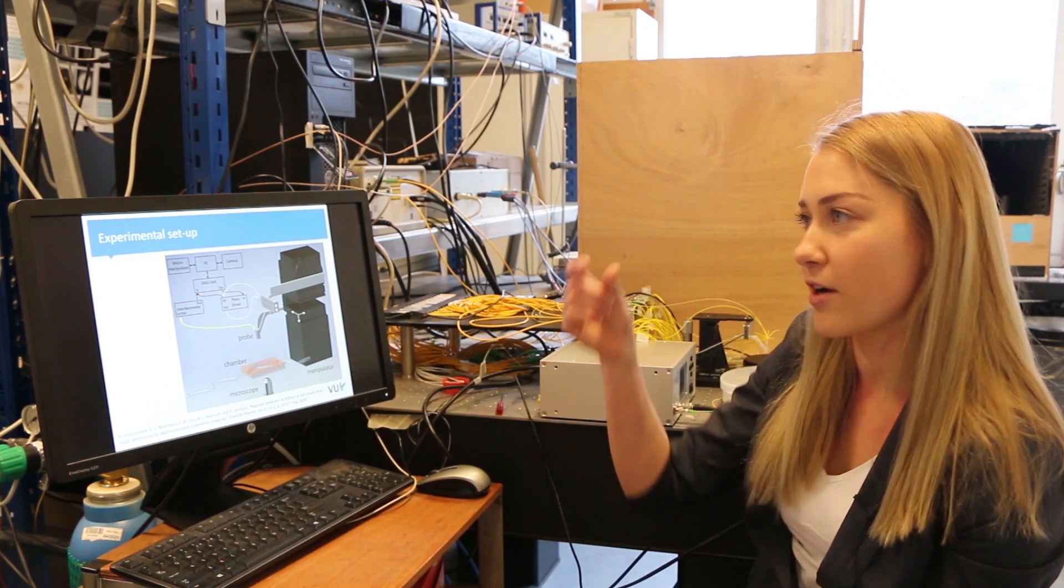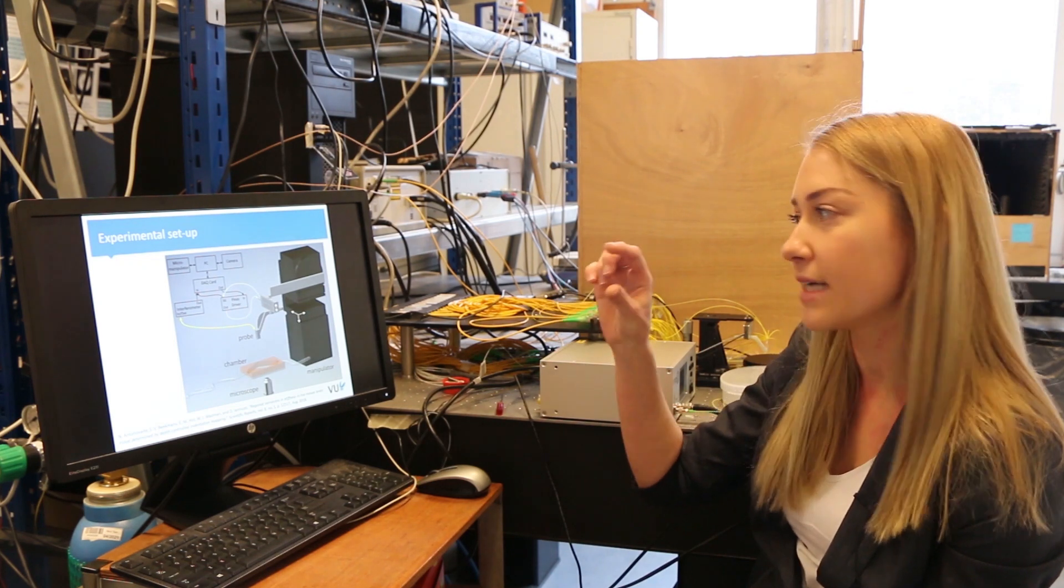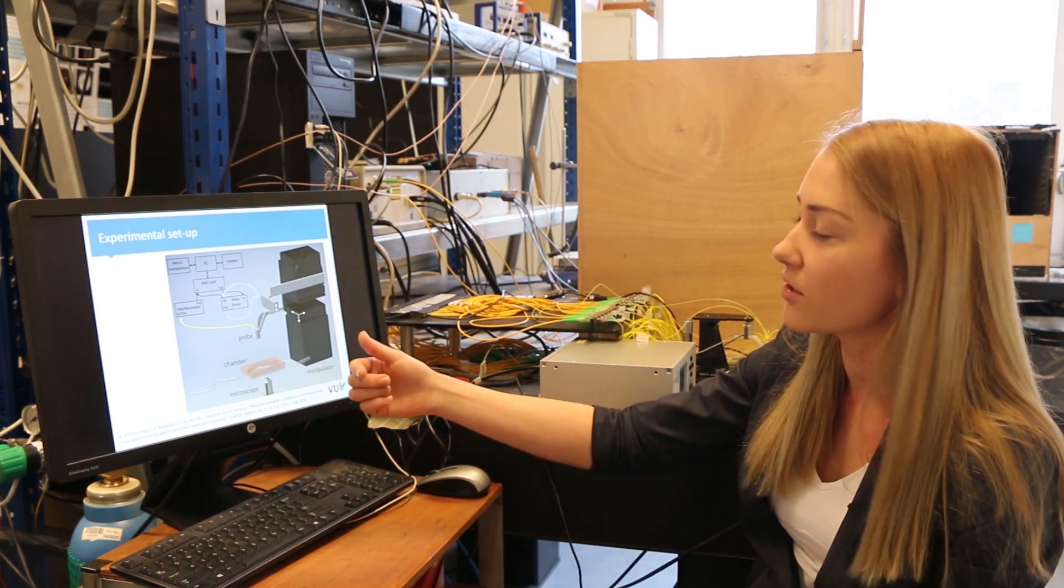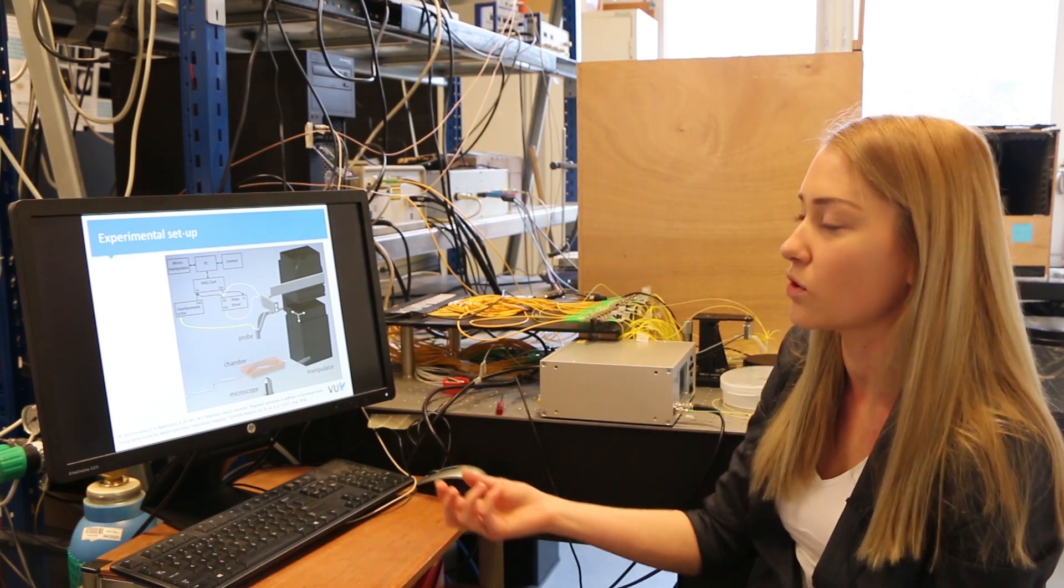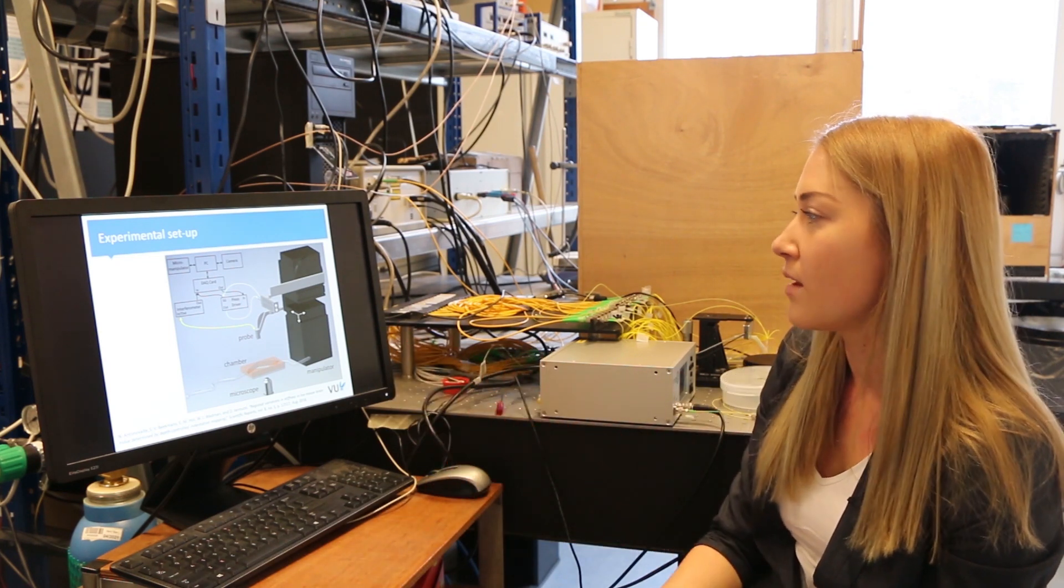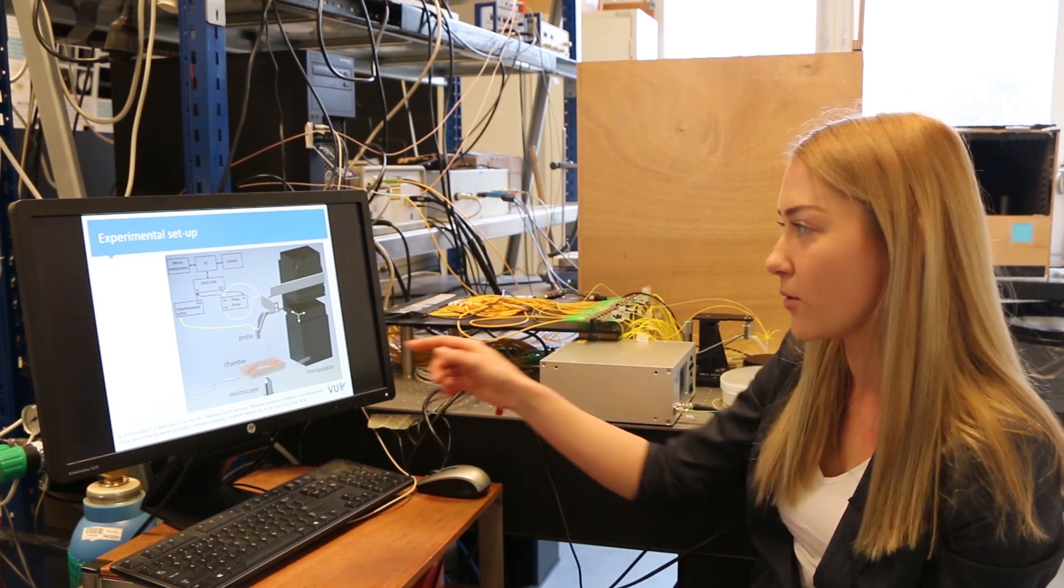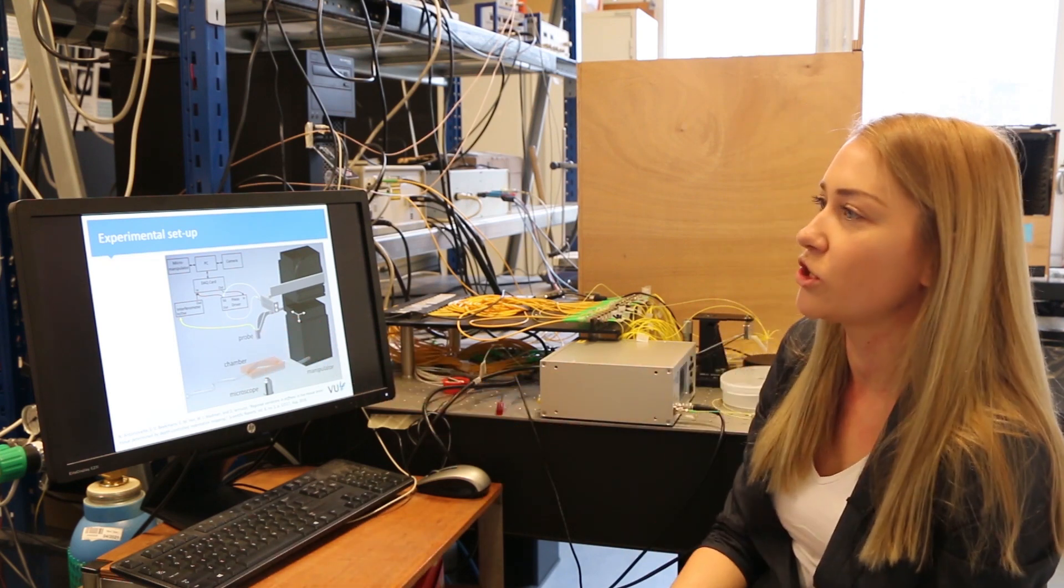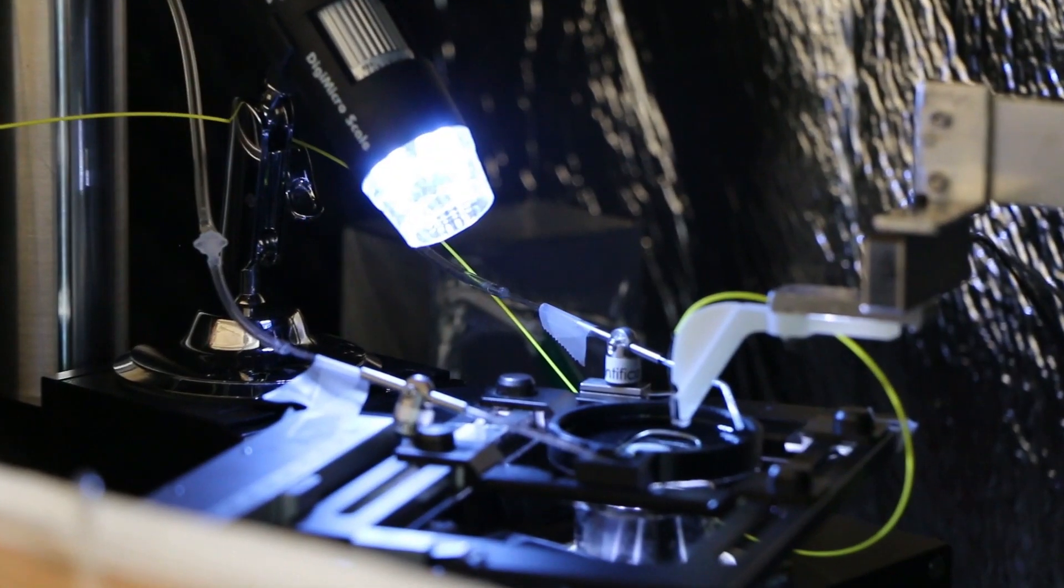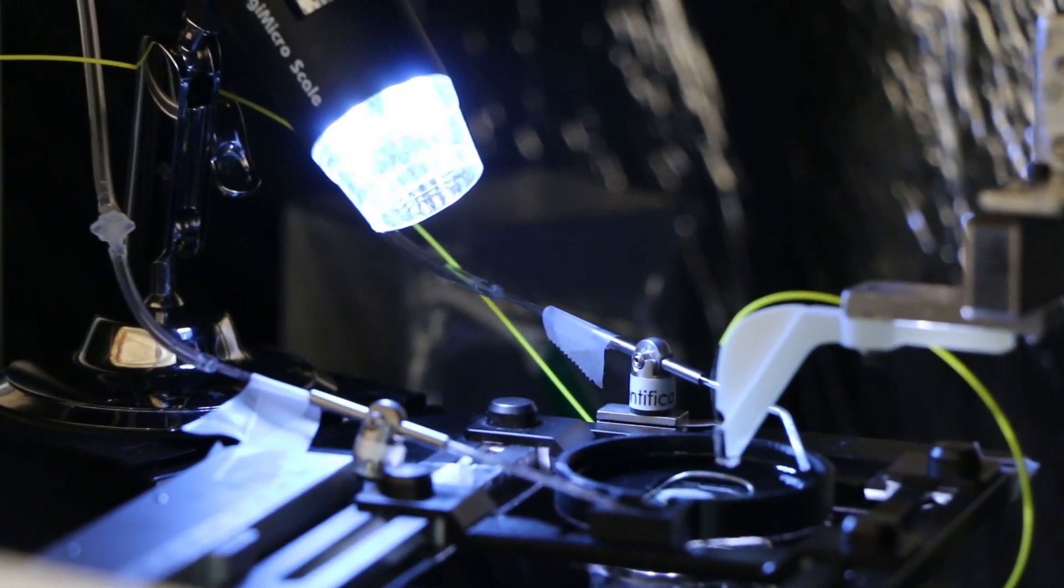It has a ferrule, it's a piece of glass with the cantilever at the end and also the sphere at the tip. And then you have an optical fiber over here which reads out the position of the cantilever. So when it's bending you see how much it's bending.